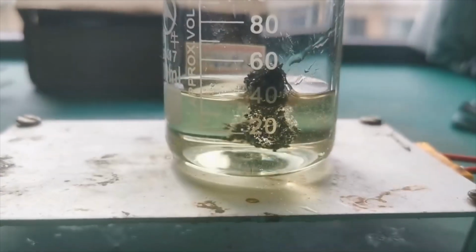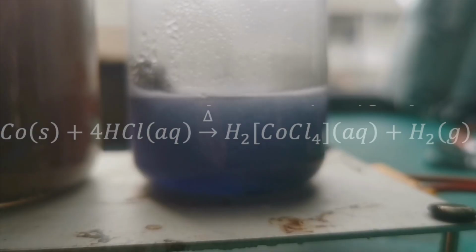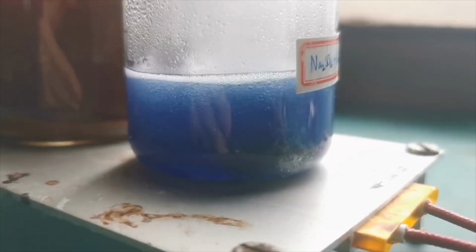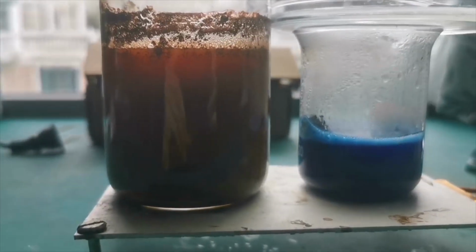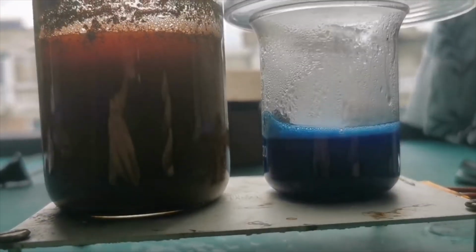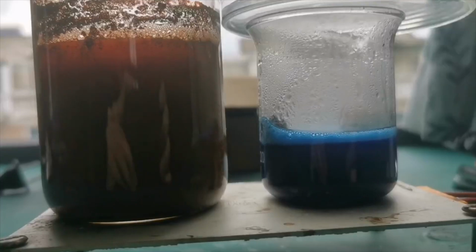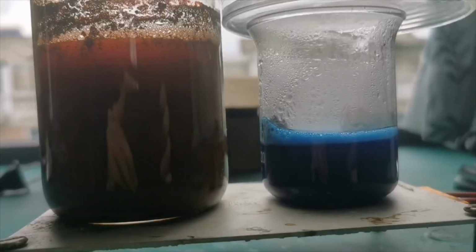Unlike in the acetic acid, the magnet immediately produced a lot of bubbles, and upon heating, the dissolved cobalt formed tetrachlorocobaltate ions and gave the solution an intense blue-purple color. The acid soon boils, and the reaction went crazy and was way faster than the acetic acid. Meanwhile, I also put the acetic acid solution on the hot plate to dissolve the crystallized salts. When placing them side by side, the color comparison is quite striking. From this point on, there will be 2 different lines of experiment going on, so don't feel confused if I was frequently switching between acetic acid and hydrochloric acid.